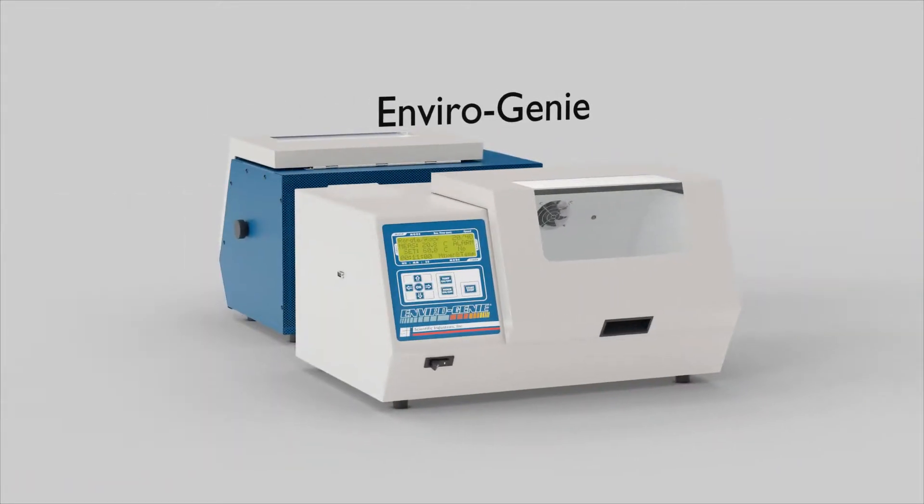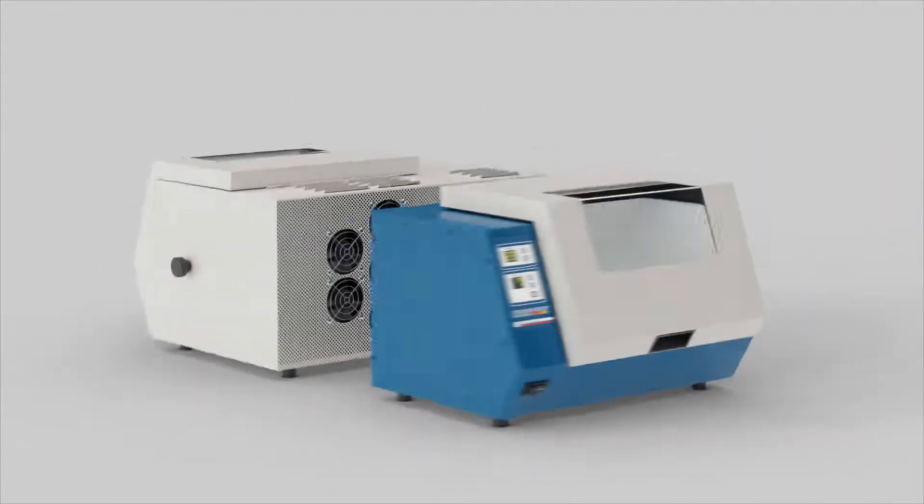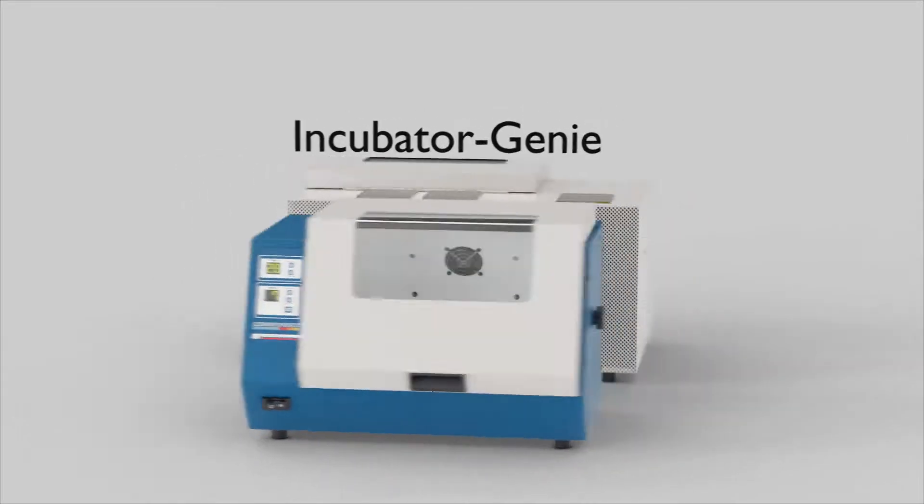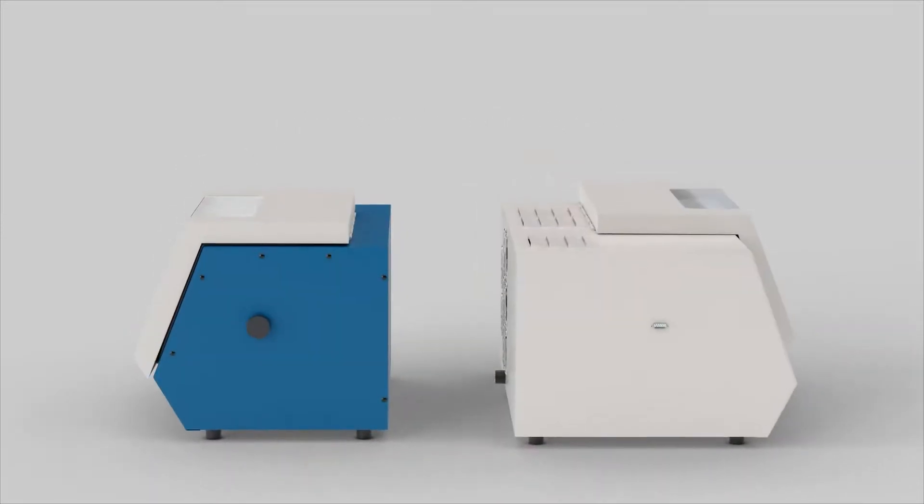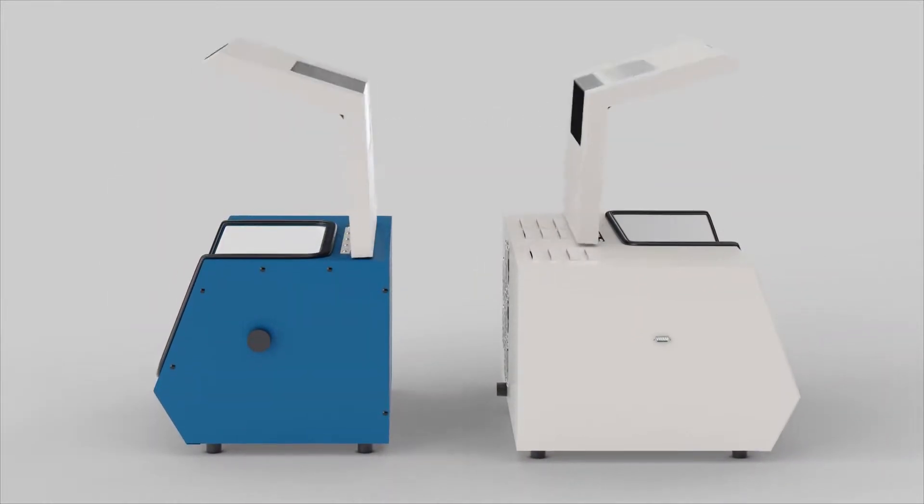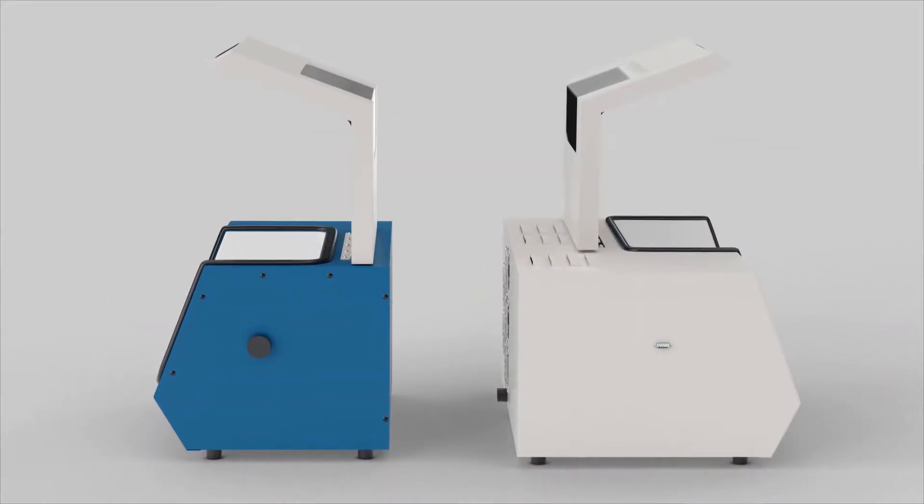The EnviroGenie and IncubatorGenie, industry's leading benchtop incubators.